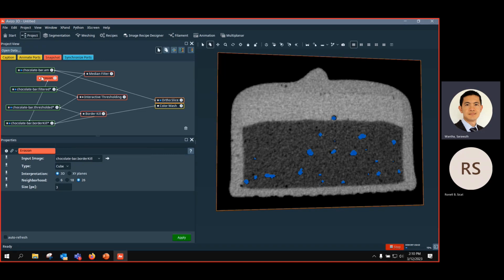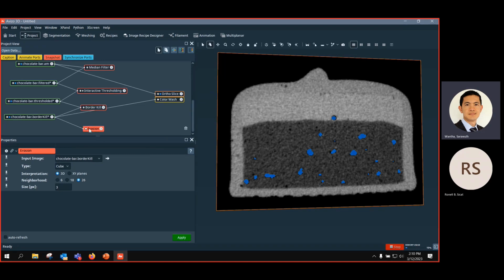Which erosion attached? So yeah, that's an implication. We will erode this object by a number of pixels. Let's say I want to erode them in 3D, so that means a ball like this. So I select ball type. That means I will erode them in 3D direction by 1 pixel, so everything within 1 pixel will be eroded. Every label image here will be eroded by 1 pixel.